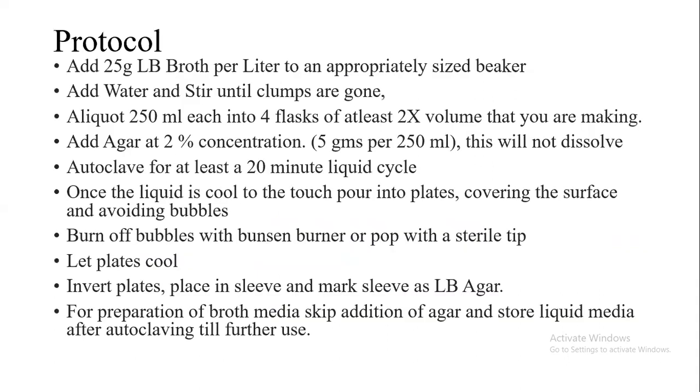The protocol will be briefly discussed for preparation of LB broth and LB agar medium. First, we need to weigh 25g of LB broth powder and re-suspend it in a total of 1 litre of distilled water. We mix the two until all the clumps are gone, and after that we allocate 250ml of medium into 4 flasks.